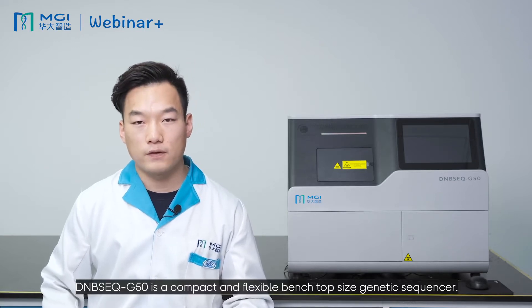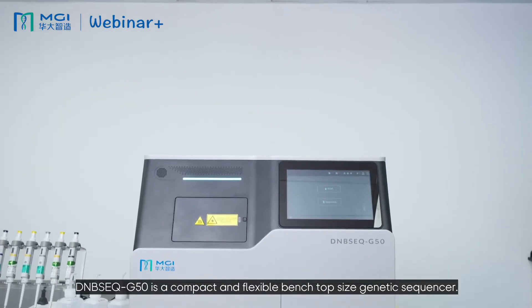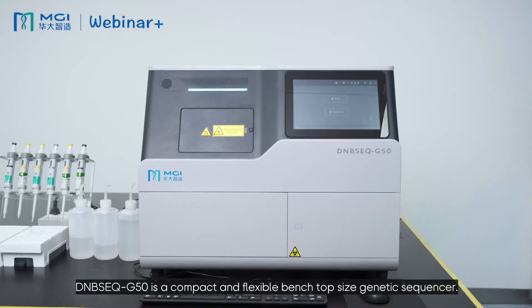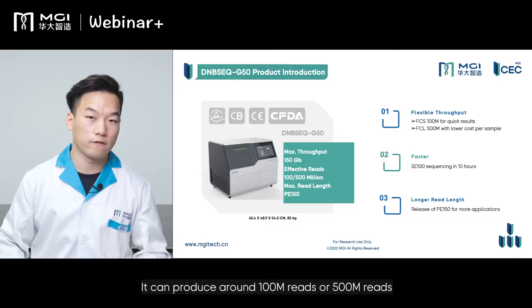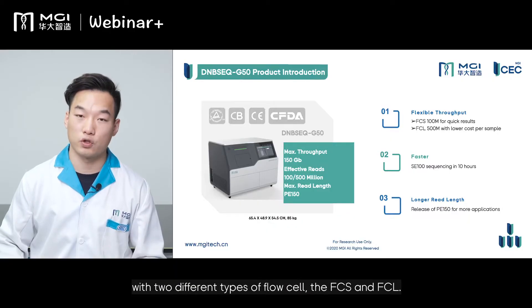The DNBSEQ-G50 is a compact and flexible benchtop-size genetic sequencer. It can produce around 100 million or 500 million reads with two different types of flow cells, the FCS and FCL.